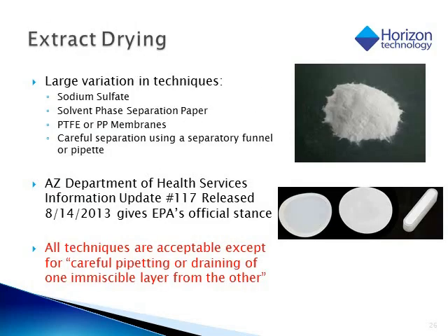With the extraction done, now it's time to dry the sample extract. There's a lot of variation in how this technique is done, from sodium sulfate to PTFE membranes. Some people even skip the actual drying step by using a separatory funnel to separate any residual water from the extract. Recently, a document released in Arizona featured a quote from the EPA stating that all the techniques listed are acceptable except careful pipetting or draining to separate the water away.